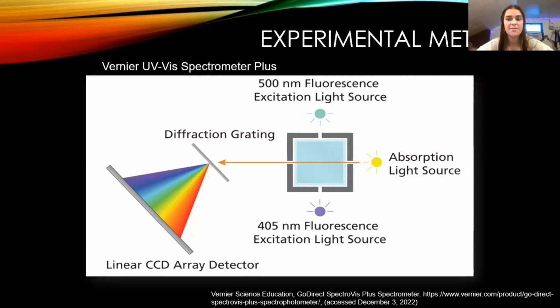The maximum absorbance in the Soret band for samples was used to determine the equilibrium constant for each sample. A Soret band, also known as a Soret peak, is an intense peak in the blue region of the visible spectrum. The Soret band mainly arises from pi to pi star transitions. The equilibrium constants were then used to determine the free energy of unfolding.